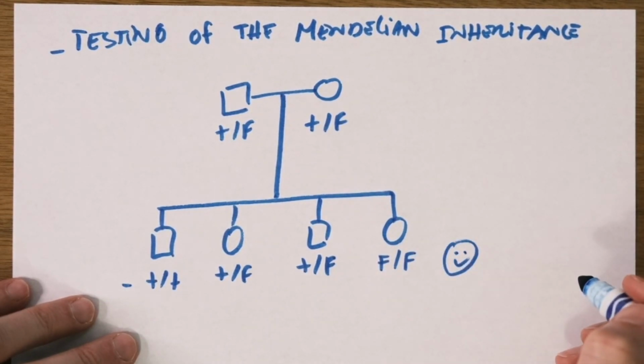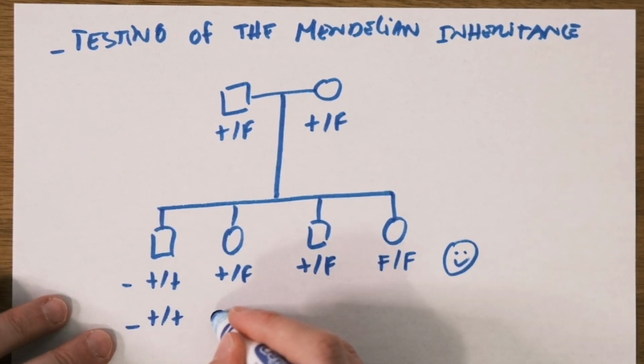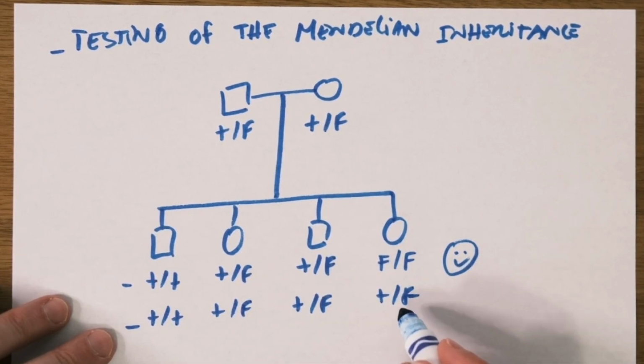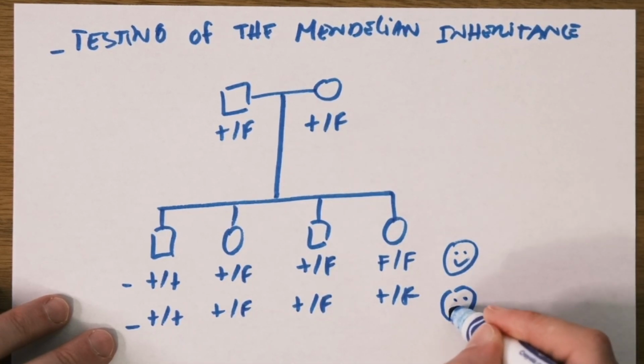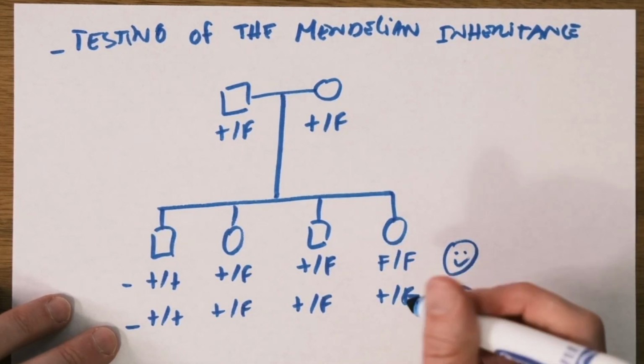This is quite good. Something that can happen, however, is that you never get that situation, and it doesn't matter what, you always get a wild type allele. And this means that you cannot get rid of the wild type allele, so maybe this is because the Flox allele is inserted somewhere else, and therefore you will always inherit a wild type allele, even from the mutants, because the Flox allele is not where you think it is. So in this case it is not great, but if you get these results in the first litter, you need to continue looking at more litters to have enough numbers and be confident that this 1/4 is not happening.